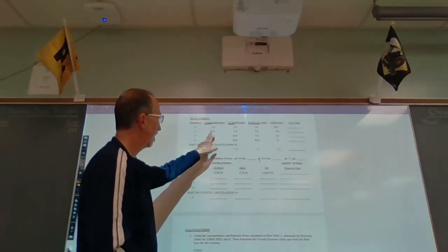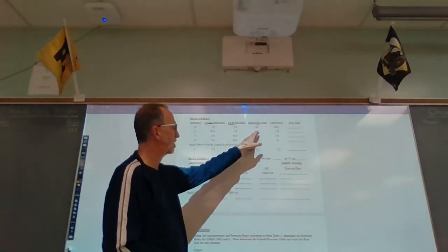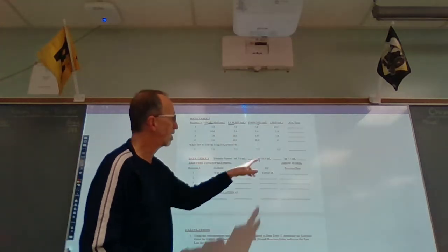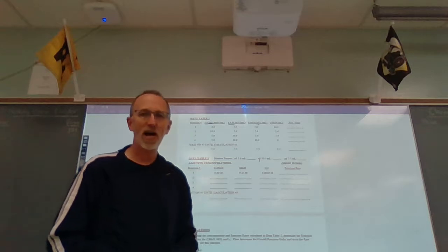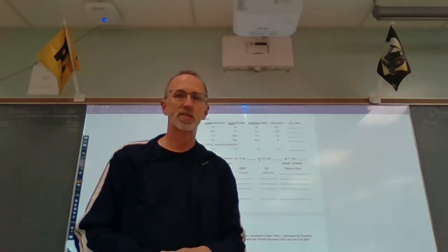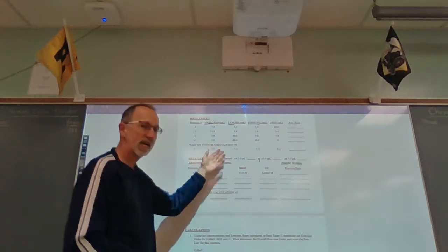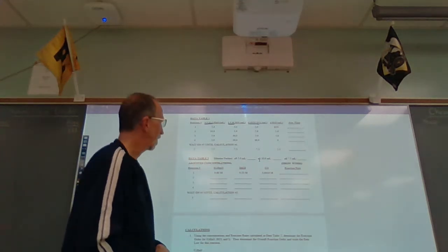So anyway, 10 mLs acetone, 5 HCl, 5 iodine. Now that totals 20 mLs. And so this time we're only going to add 5 mLs of water, which gets us to that same volume total of 25 mLs. We've done the same thing in reactions 3 and 4.